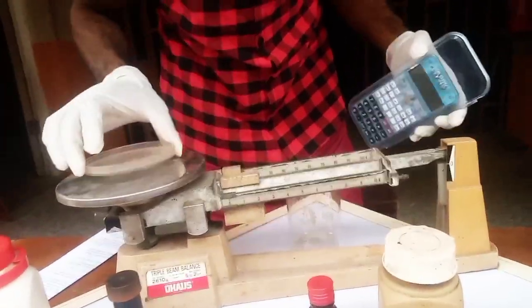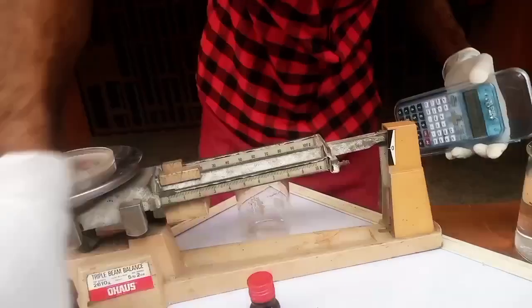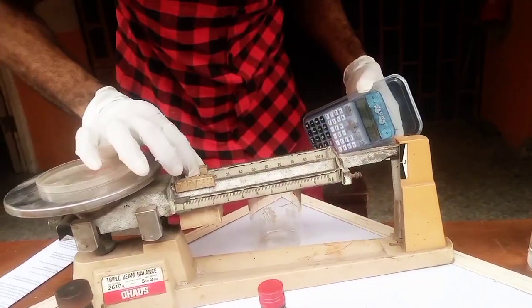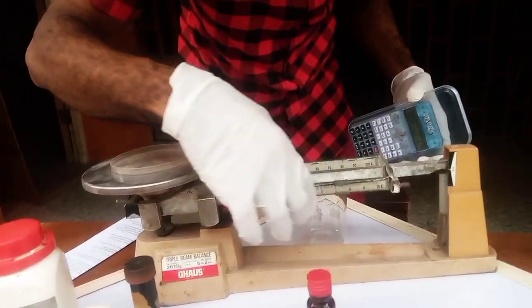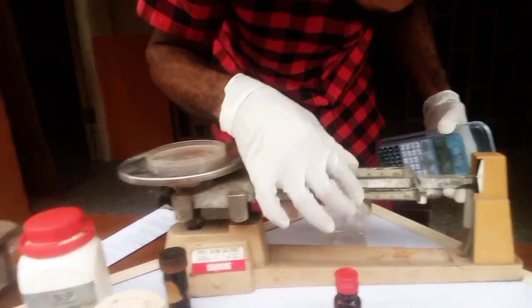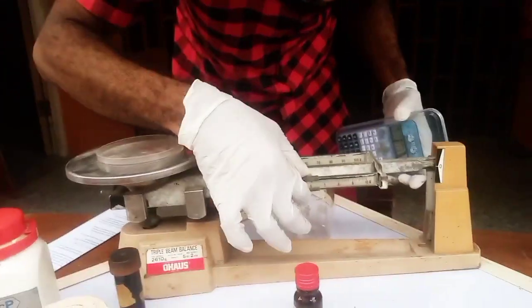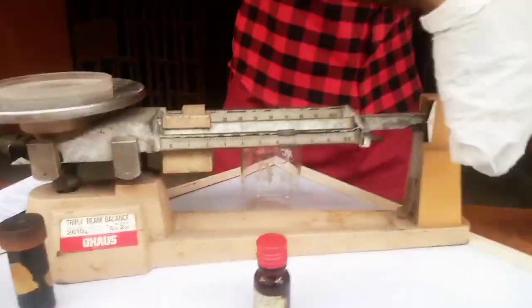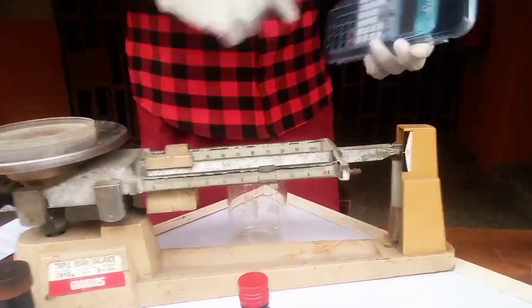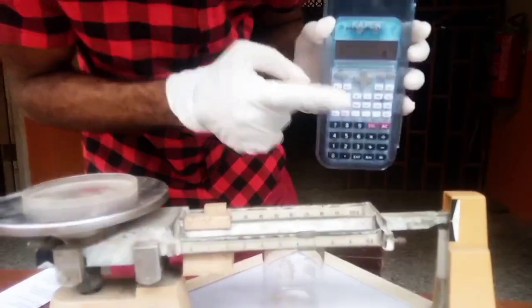Asked to use 25.4 gram of iodine and dissolve it in 6 gram of potassium iodide solution up to 1 dm cube. Okay, that is what I'm trying to do here, trying to get the zero value of the petri dish on the beam balance. Yes, I use the analog. I make use of it sometimes, and most times, let me put it like that.